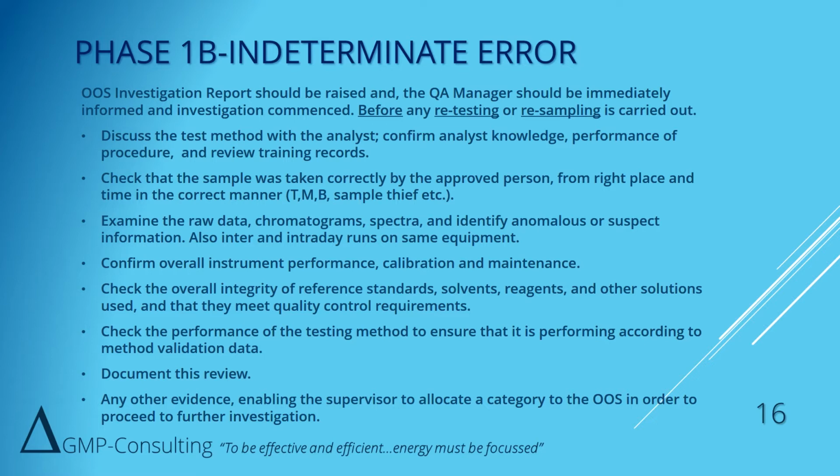Some companies don't have a specified person, but when you have complicated processes, it is important to make sure you get the sample that's representative from the right part of the process, and this is often figured out during the R&D process development stage. Also, you've got to look at all the chromatograms and look at any changes in relative retention times and the peaks.